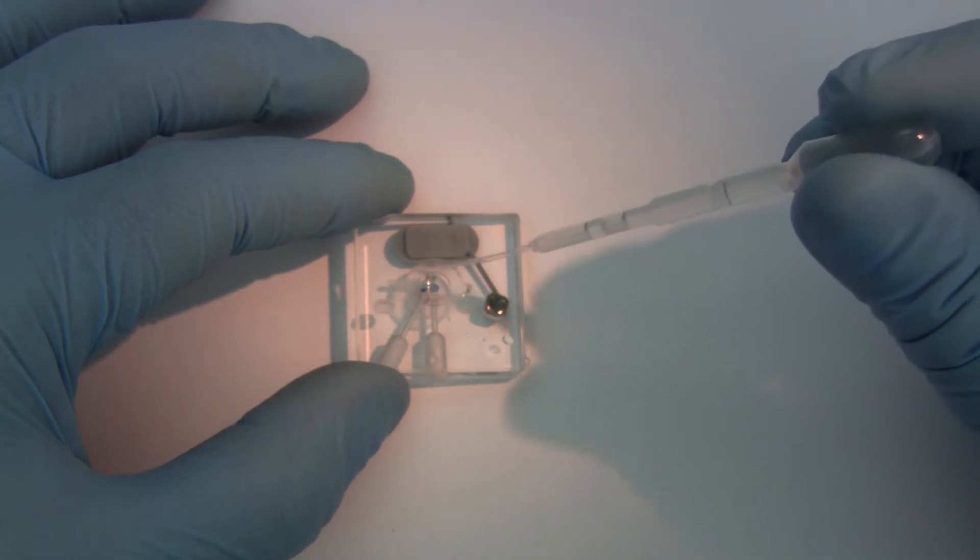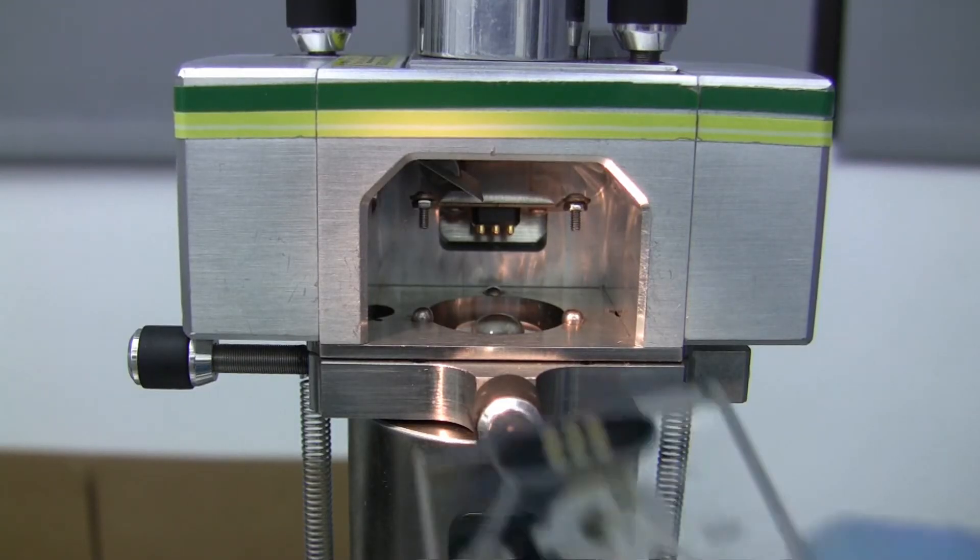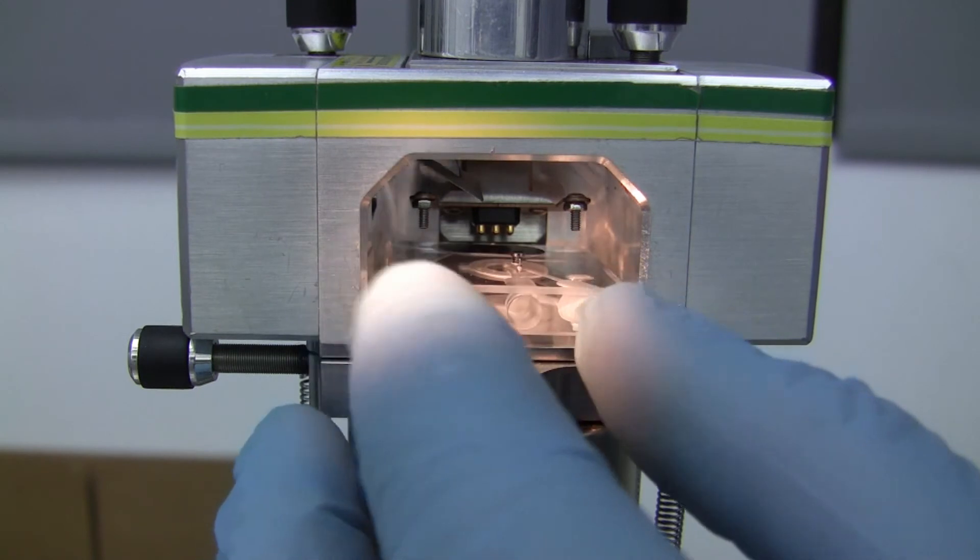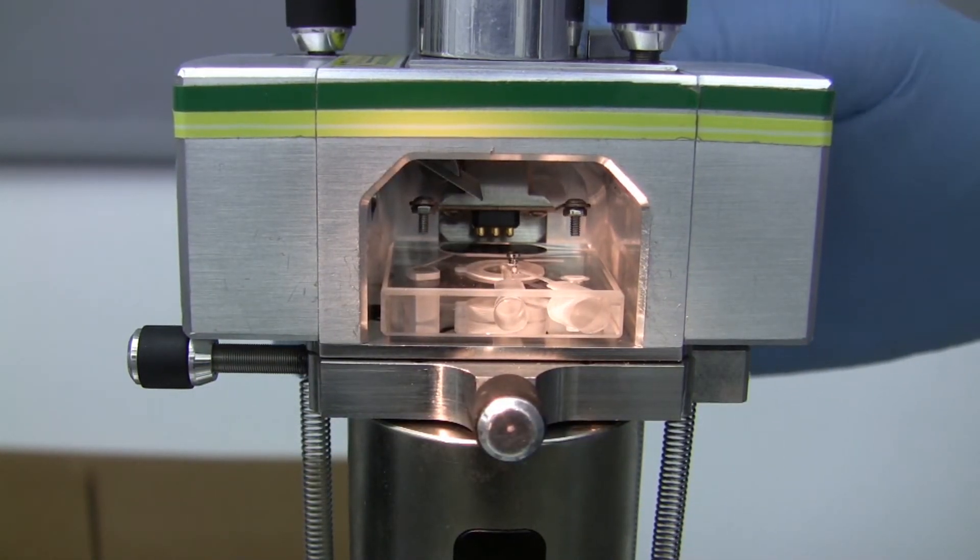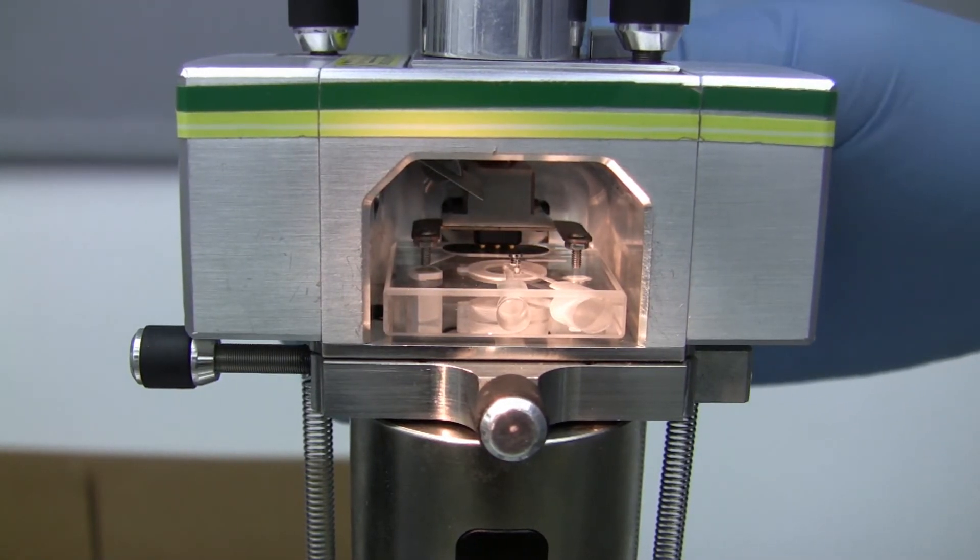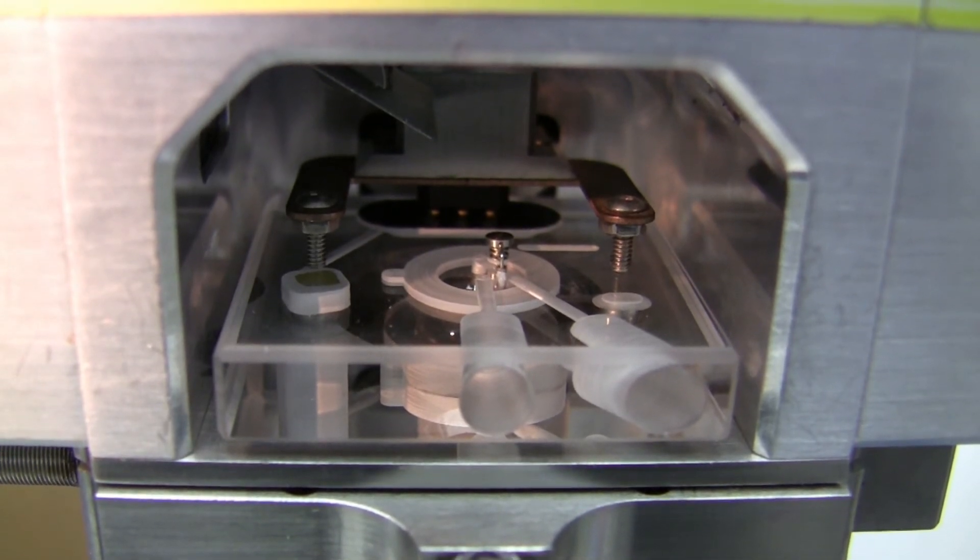Deposit enough liquid over the probe carrier to cover the probe. Put the carrier back into the head and secure it in place. Lower the head back down until the fluid droplets merge together.